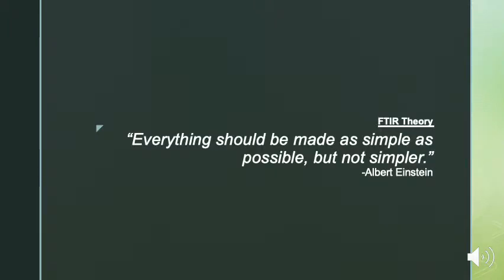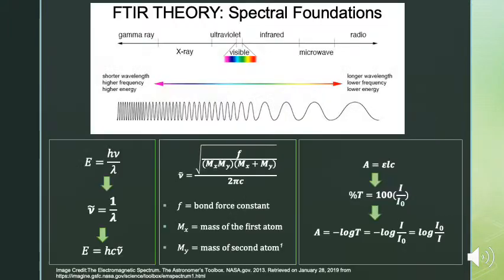Now, to set up the sample situation, I'm going to briefly go over the fundamental considerations of FTIR theory for both transmission and ATR techniques. Infrared or IR radiation is already a low energy radiation, and it's responsible for many of the molecular vibration modes that we see. The absorption of energy by matter causes the excitation of vibrational motions in molecules, such as stretching, bending, rocking, etc., and each of these vibrational modes is wavelength dependent.